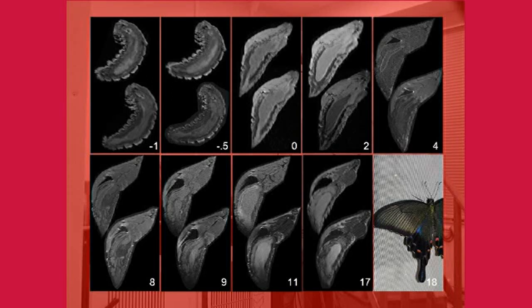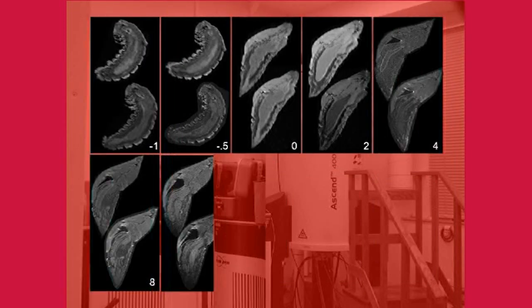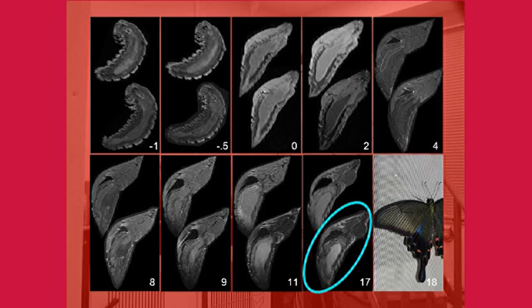The reason may be that the ovaries of female butterflies are spread out on both sides of the median plane, so even if the changes in the median plane were tracked, the changes could not be imaged. Other changes were almost the same as those of the male butterfly, and it was also confirmed that the T2 weighted image became very dark on the day before emergence.